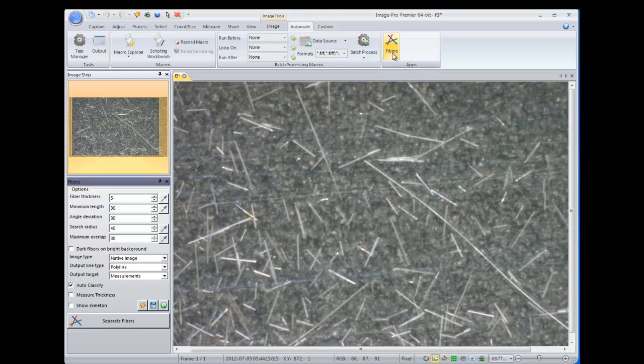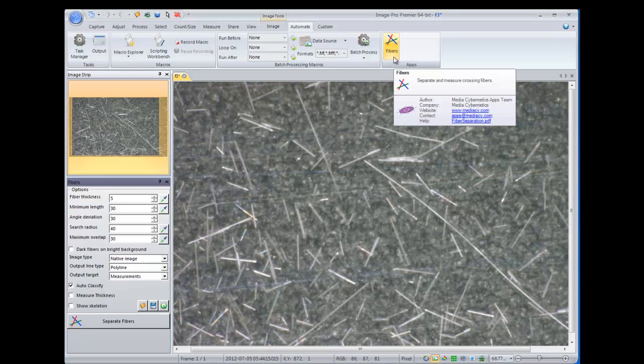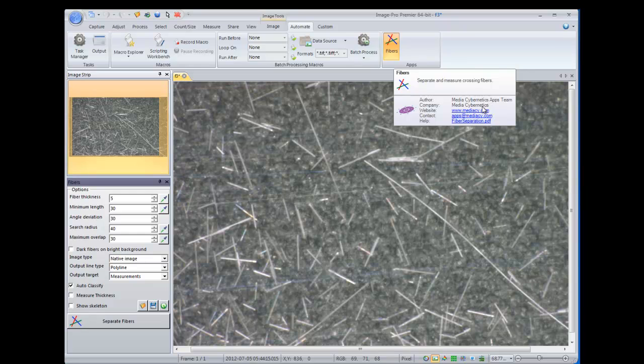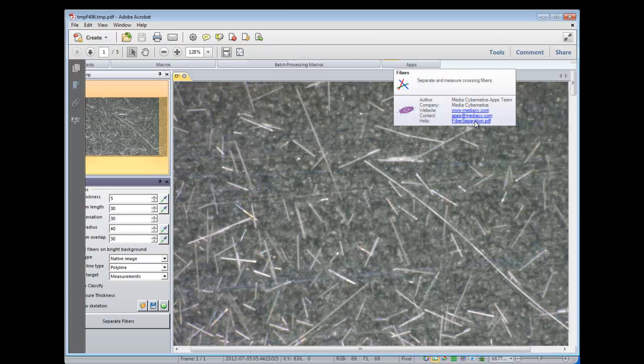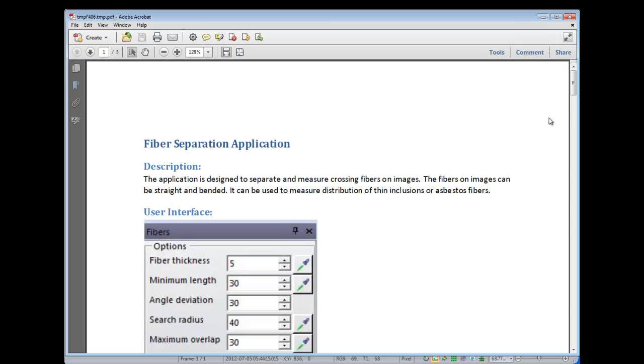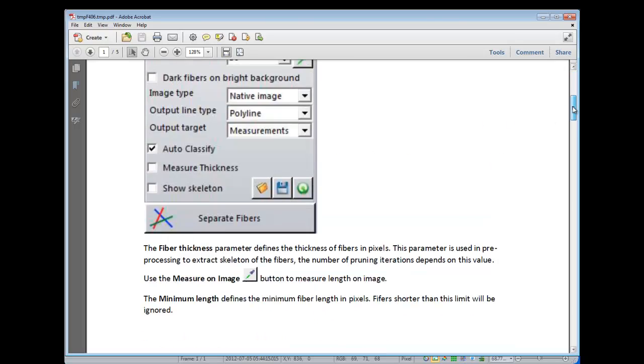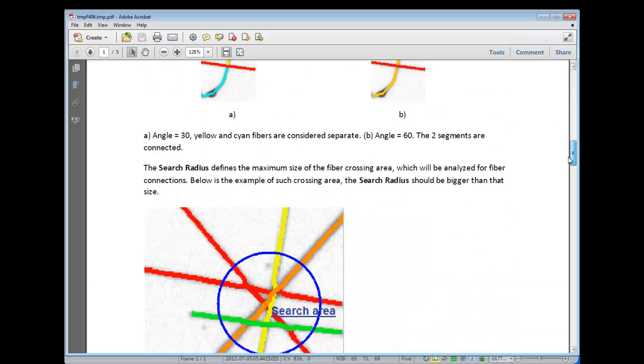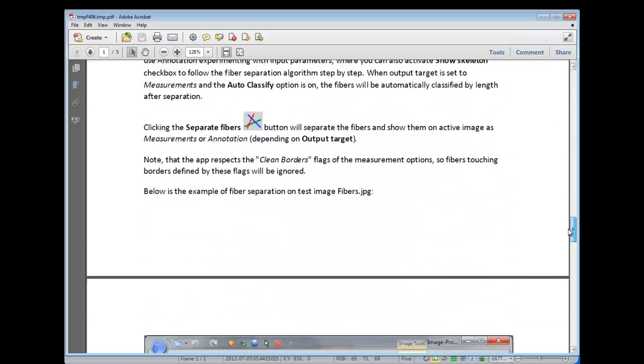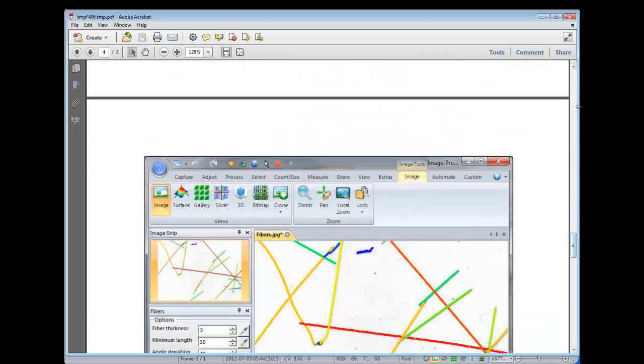If we hover over that button, you can see additional information about the app, as well as a nice PDF which walks us through all of the different features of the app. So it's basically your app help file.